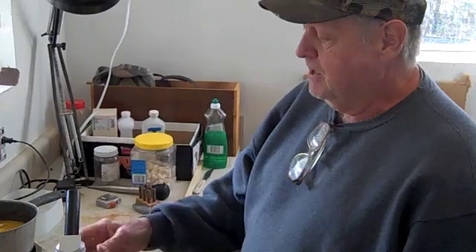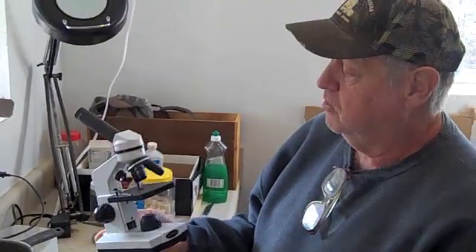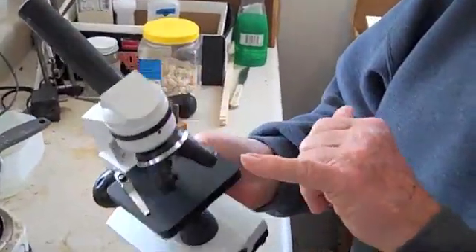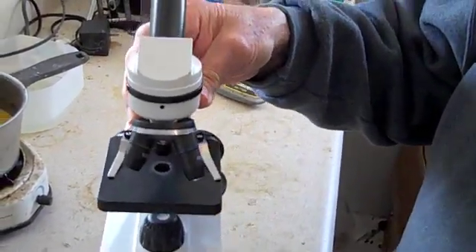I'm no scientist, got a seventh grade education, but this is a valuable little piece of equipment. This is a school microscope. It goes from a 4X, 10X, and a 40X, and you can buy these for less than 80 bucks.